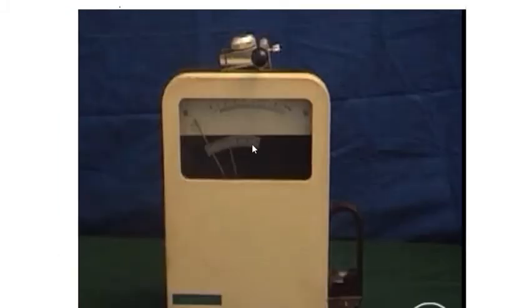This is the elongation scale. This is the load scale. This is what you can see in the front of the instrument. And then you can see here there is an arrangement for the placement of the jaws J1 and J2. And at the bottom you can see a catch which is used to release the beam.